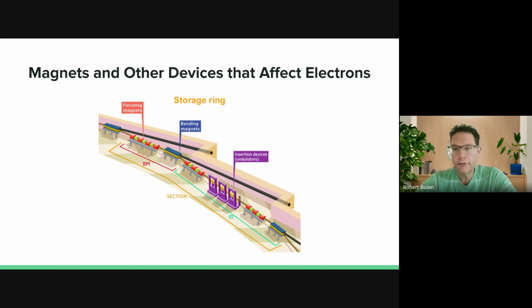Those magnets are electromagnets, so they generate their magnetism by having electricity pass through them. So this beam line, actually all the beam lines, generate a tremendous need to have a lot of electricity in order to maintain the magnetic effect of keeping the beams going and of keeping the electrons moving. So there's a tremendous amount of electricity that is used by this facility, and this facility, when it's running, runs 24 hours a day, 7 days a week. So you can just imagine the amount of electrical energy going into this to make this work.